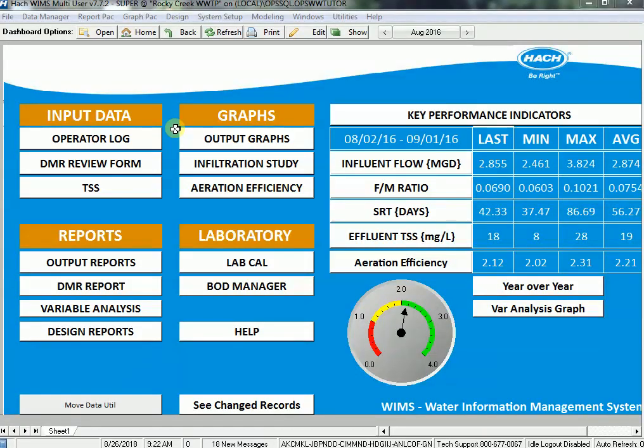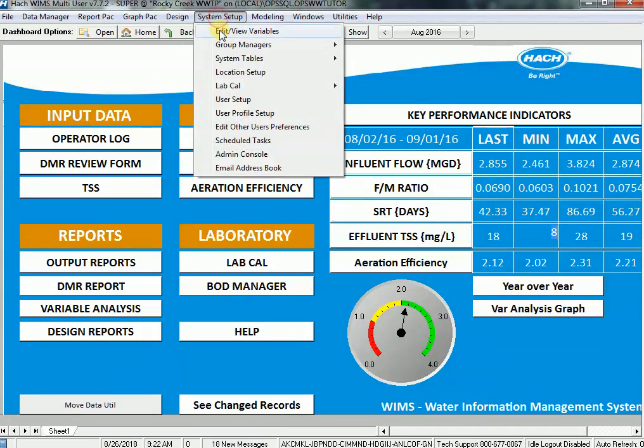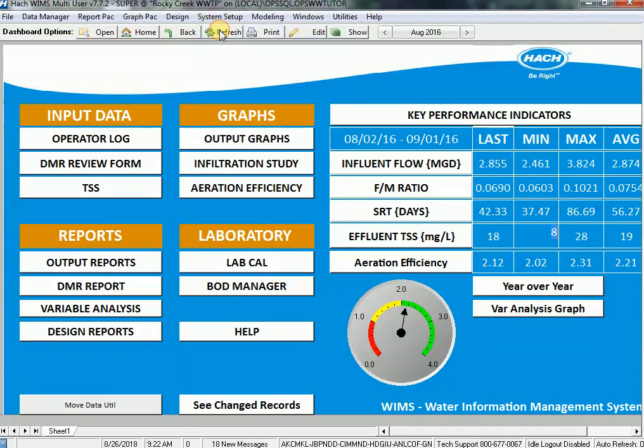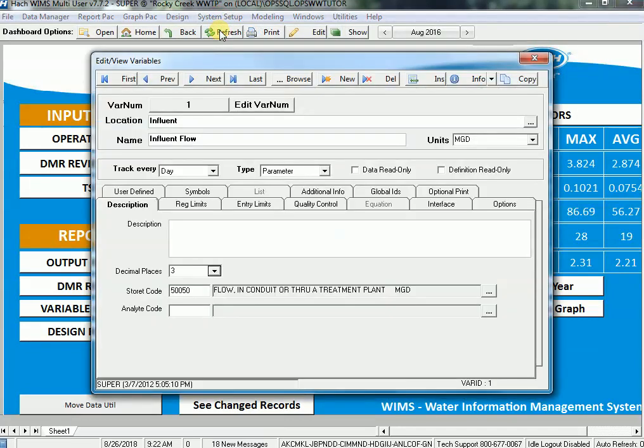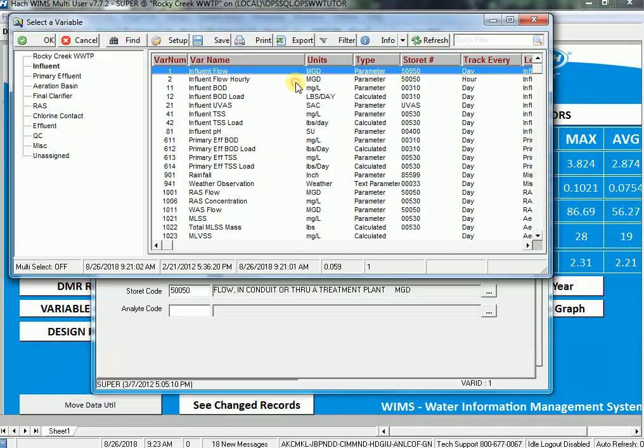In this case, I want to set up a new picture-type variable. I'm going to System Setup, Edit View Variables. I'm going to track my microscopic inspection pictures that I have about my mixed liquor that the lab does, so I'm going to create a variable for it.